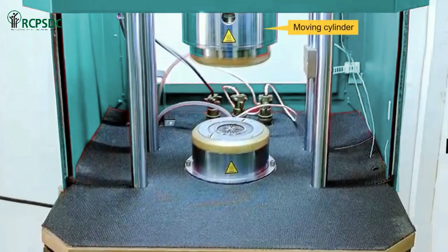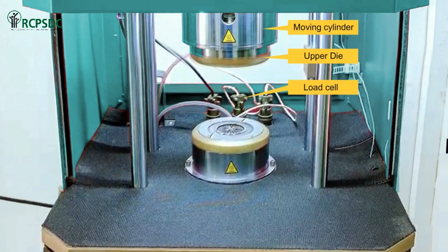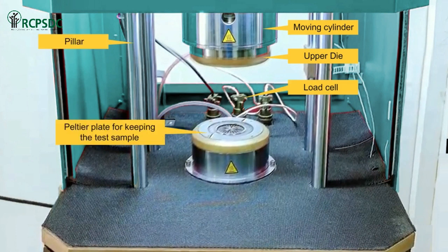In this animation video, we will learn how to check rheology property of a rubber compound with the help of moving disc rheometer. First, we will understand about the main parts of a rheometer.